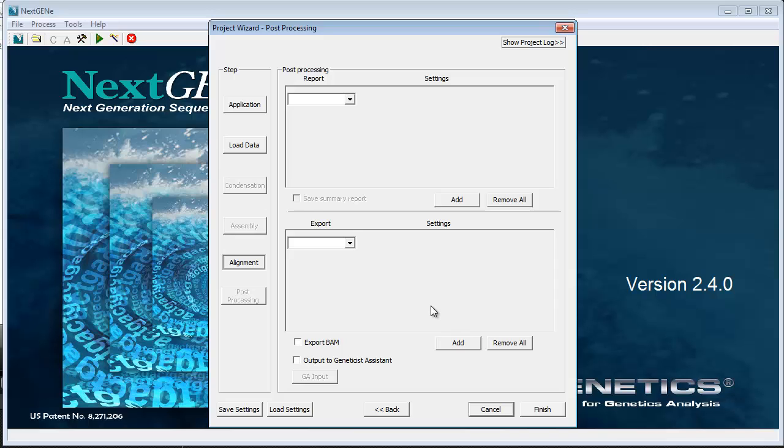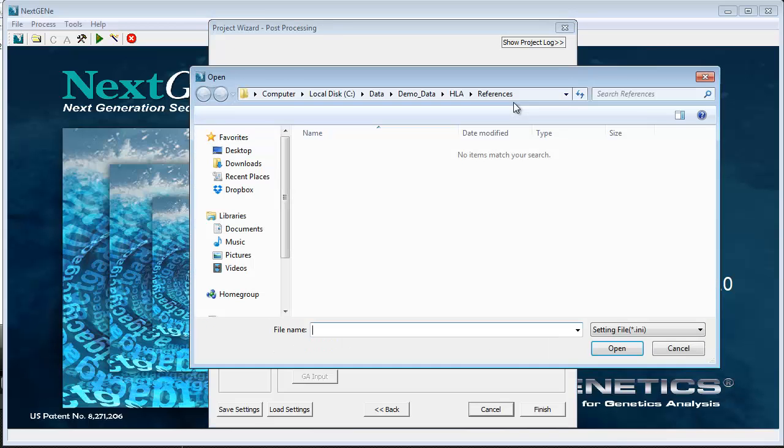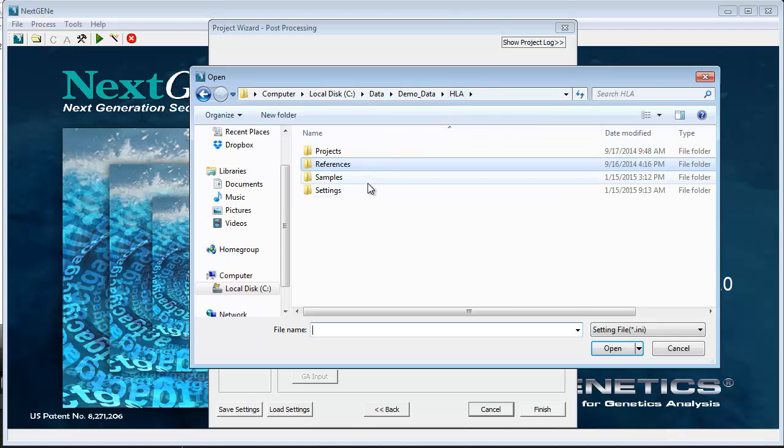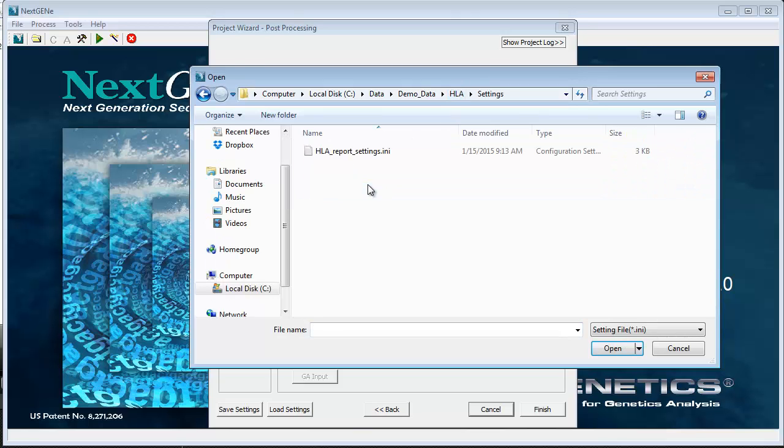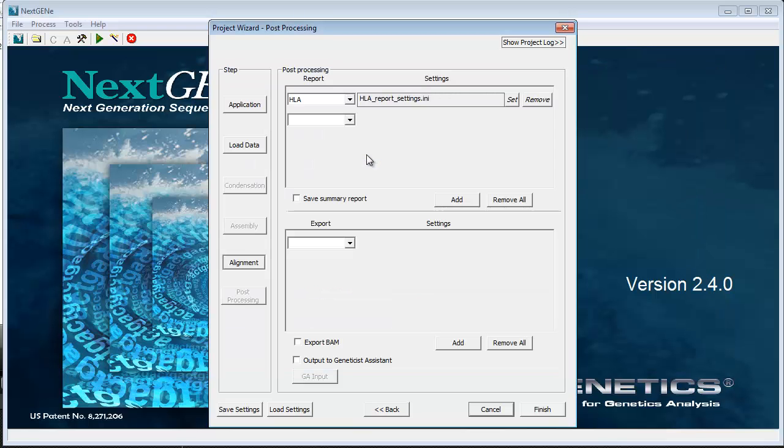To automatically export the HLA report, select HLA from the report drop down list. Then click set to load a settings file for the report. The settings file can be saved from the viewer and we will go over saving this file when we switch over to the viewer to review the results.